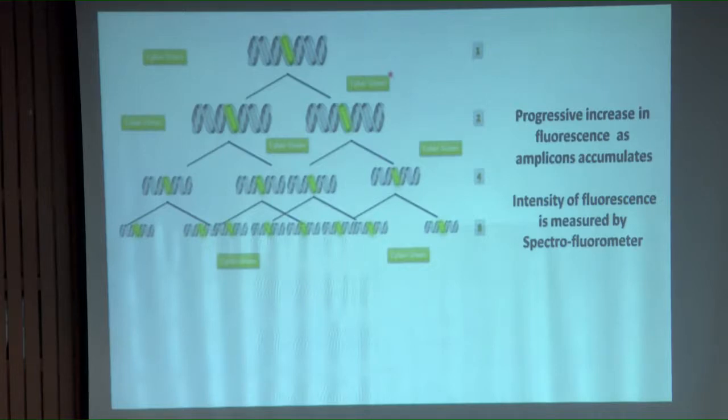The question here is, how many of you have seen the qPCR results, right? I'll show you the picture here, how it looks like. How do you visualize? I told the reactions can be monitored. What do you mean by monitoring the reaction? What is the indicator of the PCR is going on? Anybody? Graphs will come, right?